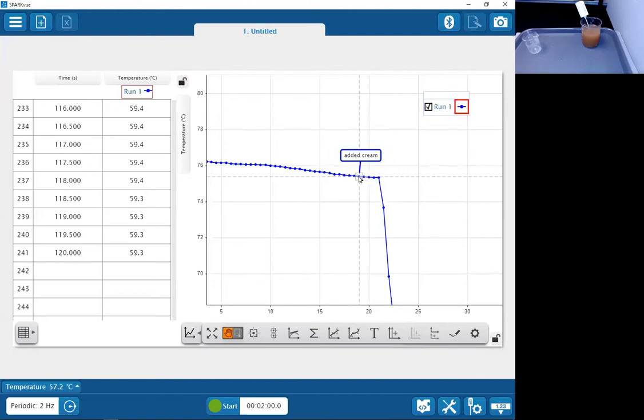It's attached to the graph by a little gray handle, and thankfully I can move that gray handle around and drop it on a relevant data point. So if I release the gray handle close to the data point that I'm interested in labeling, you'll see that the gray handle snaps to it. I can also move the label itself if it's out of the way or I need a better view of it.